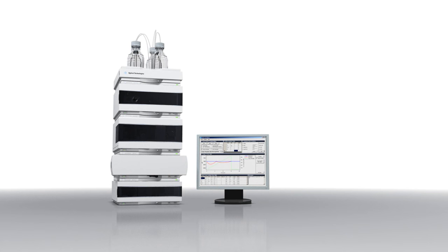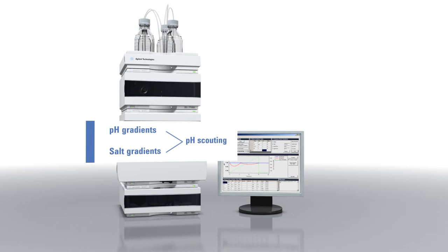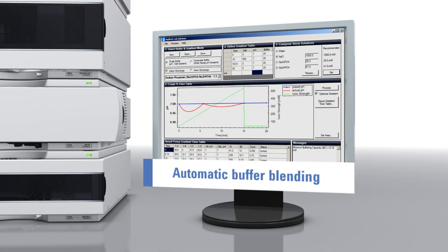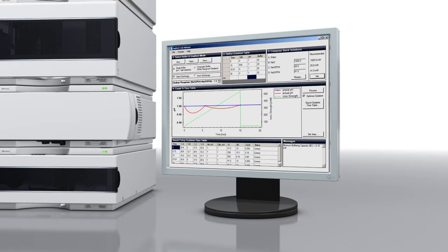During method development in ion exchange chromatography, buffer systems are used to create pH or salt gradients for pH scouting. In combination with the Agilent 1260 Infinity Bioinert LC system, Agilent Buffer Advisor software helps you automate the blending of these buffer systems, eliminating the tedious and error-prone steps associated with manual buffer mixing.